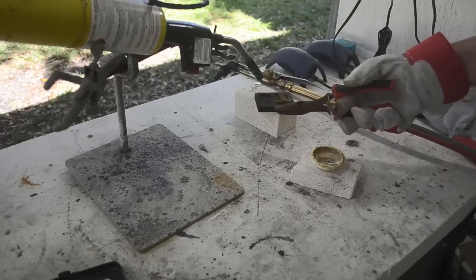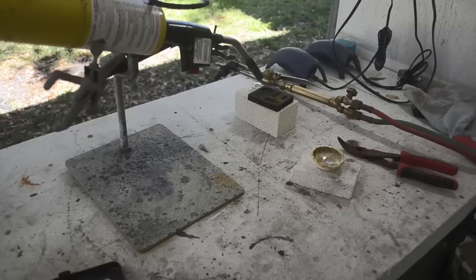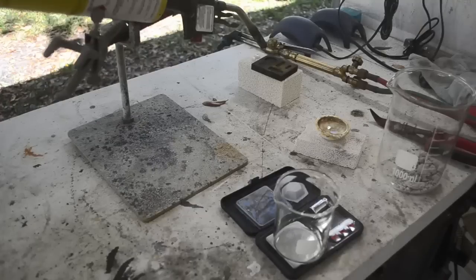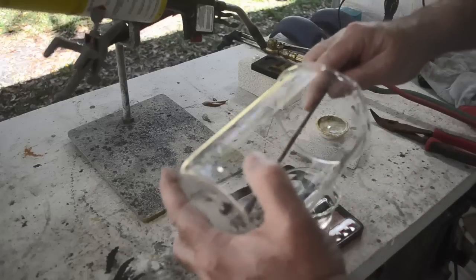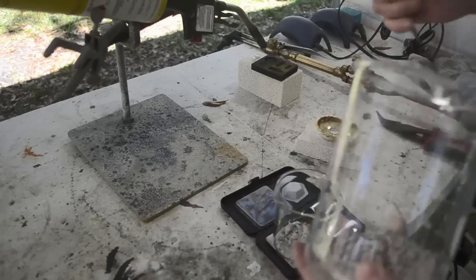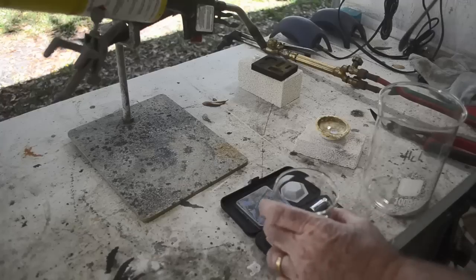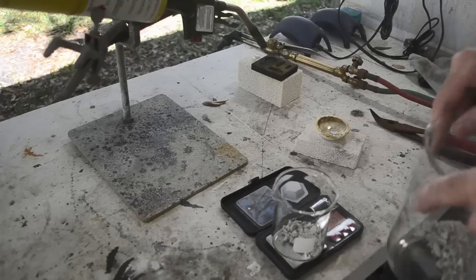And I'm going to measure out, while everything's good and hot, 8 grams of the stuff that we boiled in hydrochloric acid, and we'll melt it down and see how it looks. Okay, the first one I did is in the fume hood, boiling in some dilute hydrochloric acid to take the borax off of it. And we'll measure out 8 grams of this stuff. That's a bit much. And then we'll melt this stuff down.